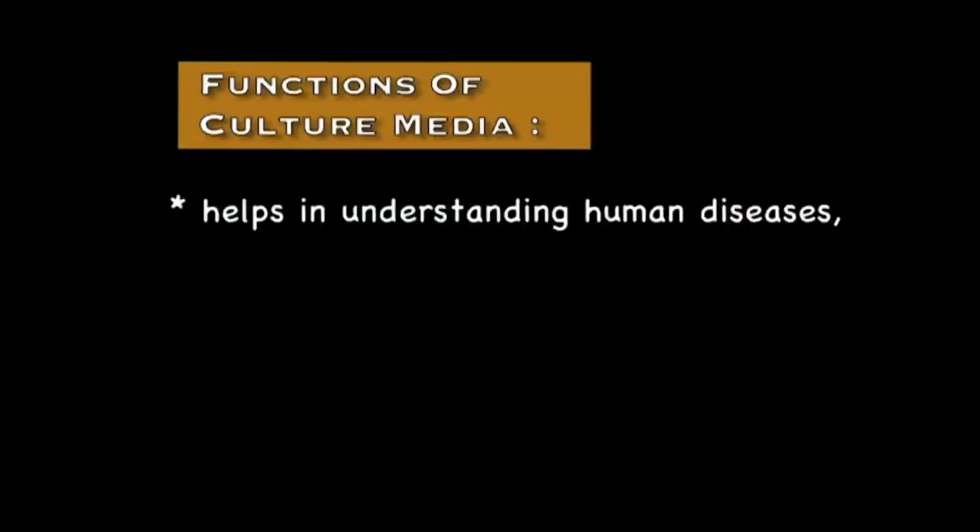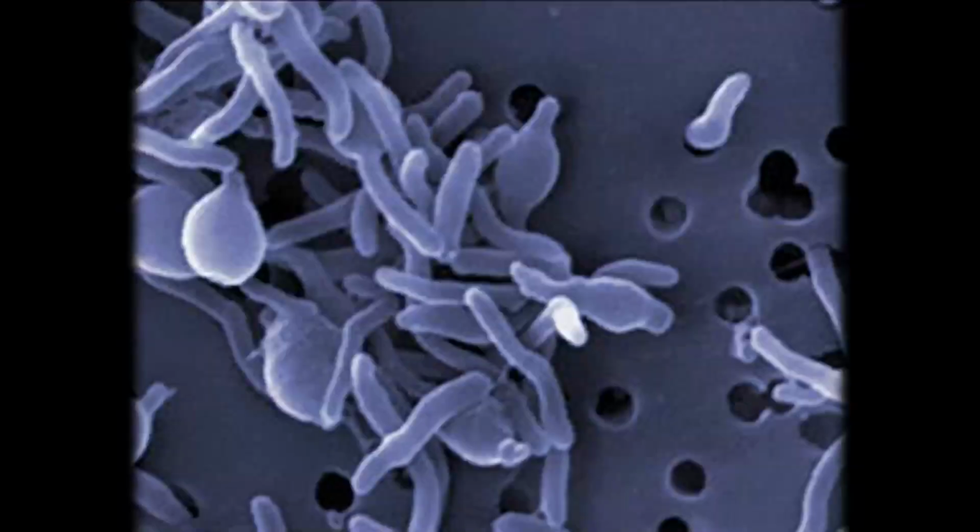Now, what is the function of culture medium? Generally, the culture medium serves many-fold functions. Let us come to the first function. The culture medium helps in understanding human diseases better, because we know that most disease-causing organisms are microbes. How does microbial culture help in the diagnosis of diseases?